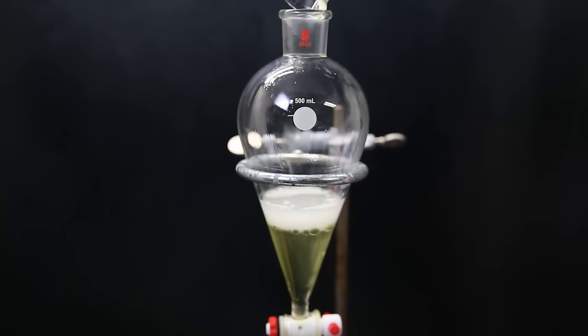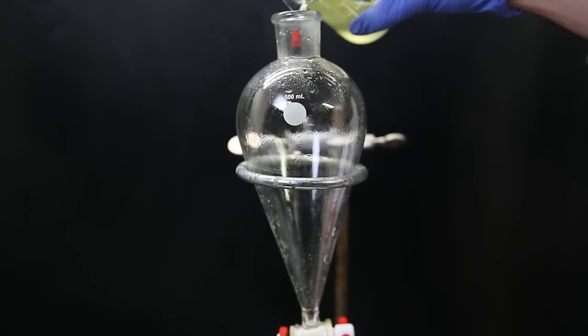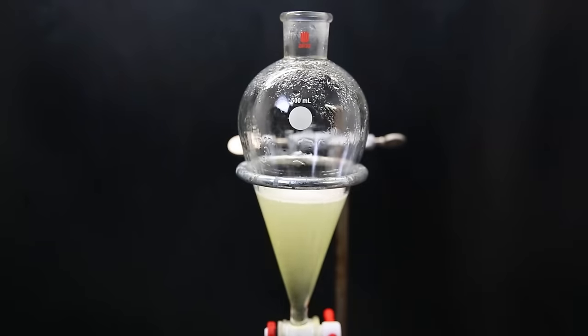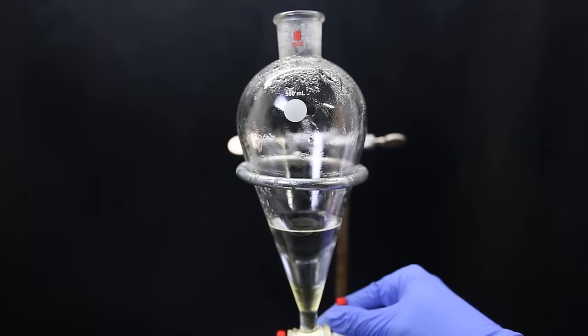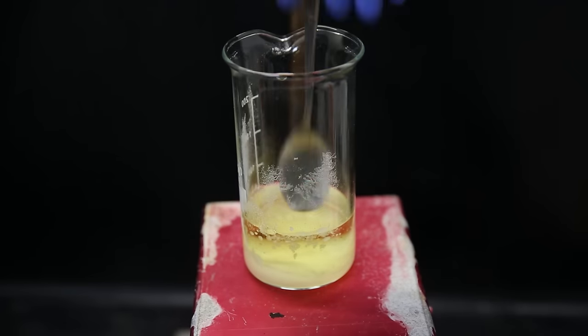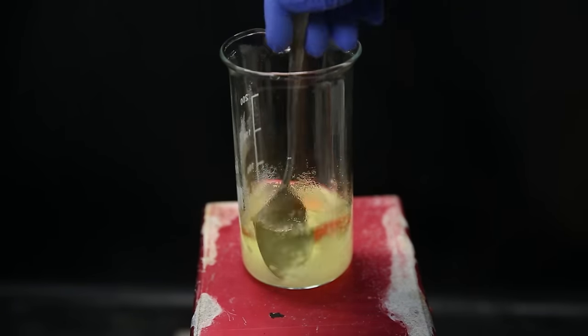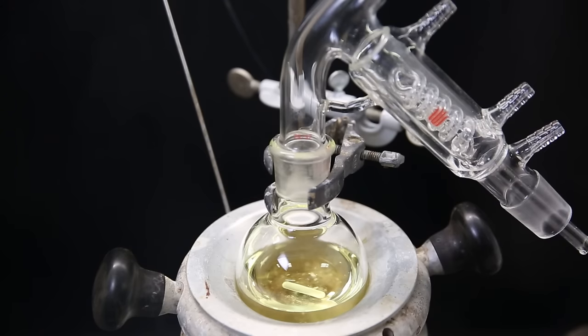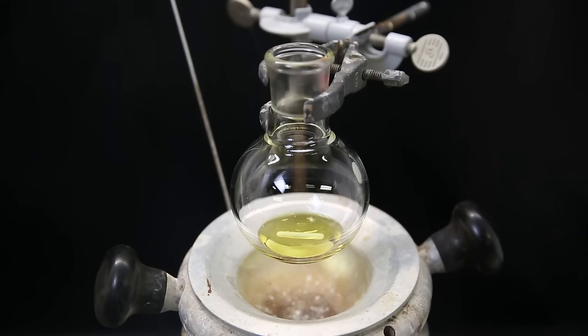I then move it all to a separatory funnel, and separate the layers. I return the DCM extract, and wash it once with some brine. I separate the layers again, and put the washed DCM extract into a beaker, to which I add some anhydrous sodium sulfate, to take up any remaining water. I then filter this mixture through some cotton, directly into a flask. I distill off a large portion of the DCM, and now I should be left with a solution of DCM that contains some nepetalactone. But the only way to find out is by testing it on a cat.